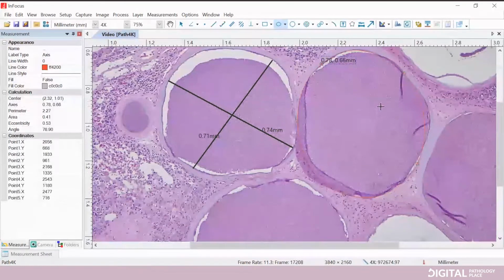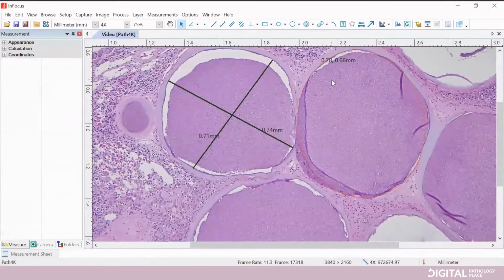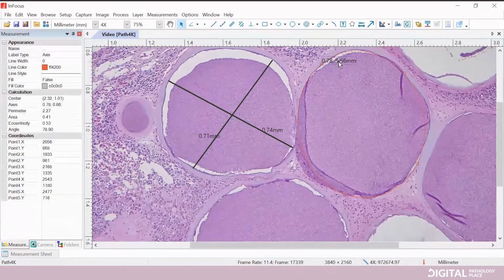Now again, it's not perfect. We're not going based off the ability to draw an arbitrary line and have it give our area inside, which we can get to. But relatively speaking, this becomes our measurement, and we can see here on our side information about the measurement.